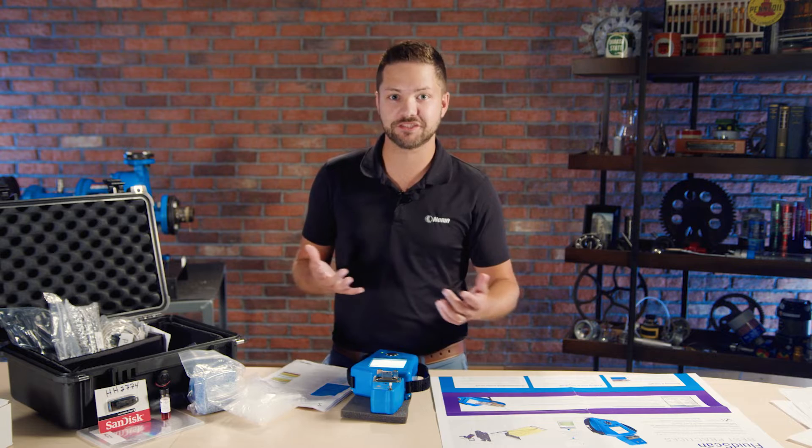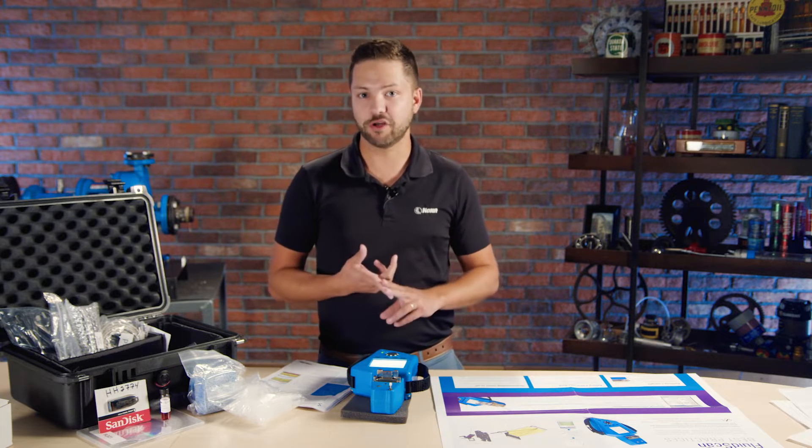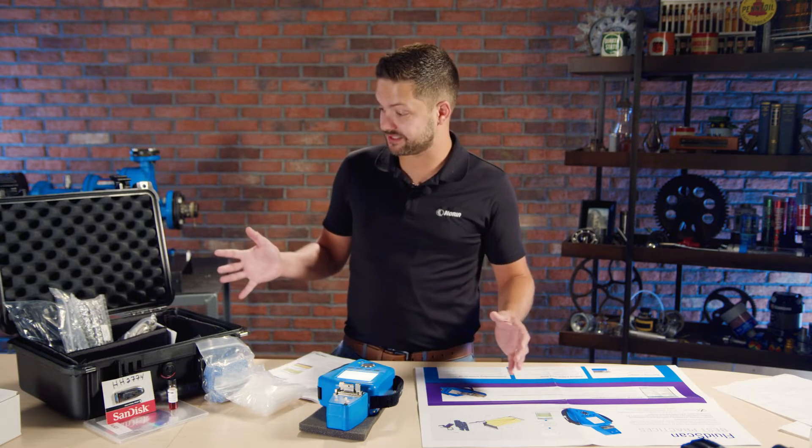If you're familiar with oil analysis, you might remember things like testing for oxidation levels. You want to know if there's water contamination, and if it's an engine, maybe you're looking at soot levels. But before we go any further, let's see what's in the box itself.